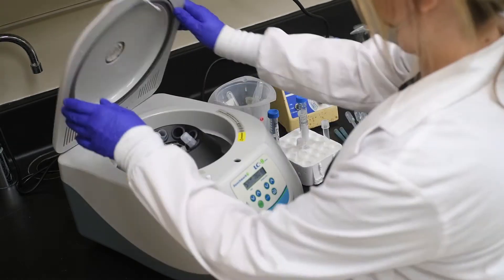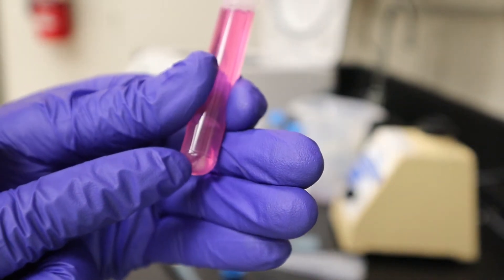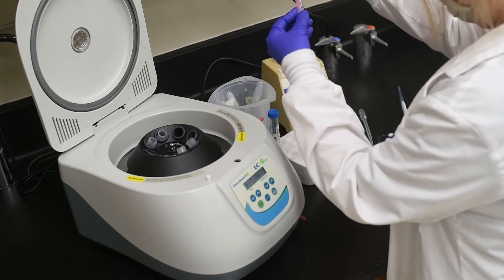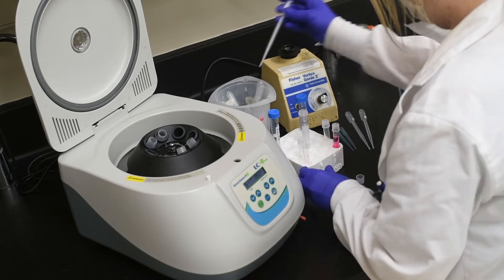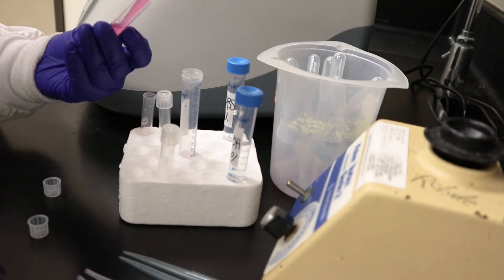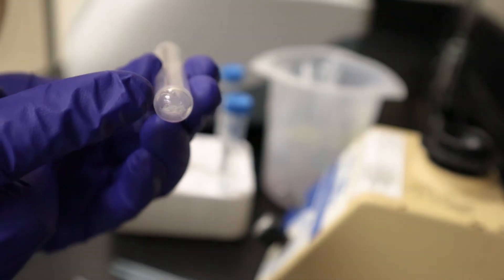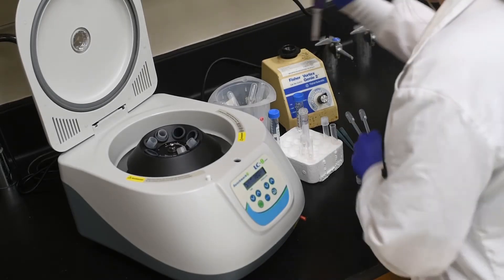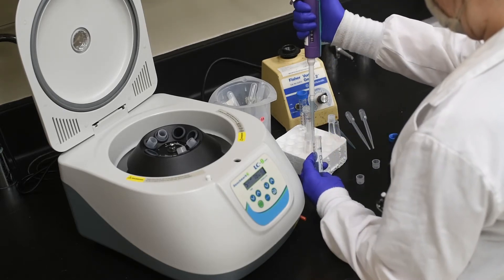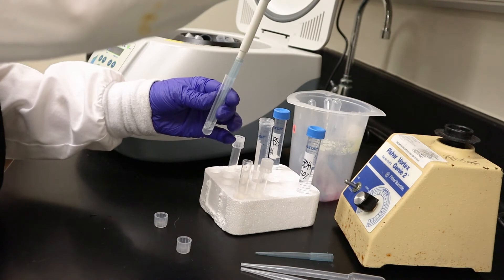After centrifugation, I carefully removed the supernatant without disturbing the pellet. Once the tube was empty with only the pellet present, I added 1 milliliter of PBS. I triturated my cells within the PBS to resuspend them and spun them down for 5 minutes into a pellet.